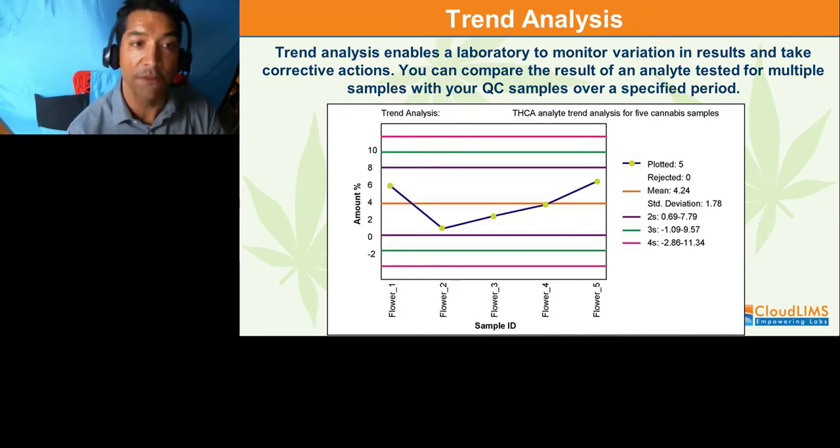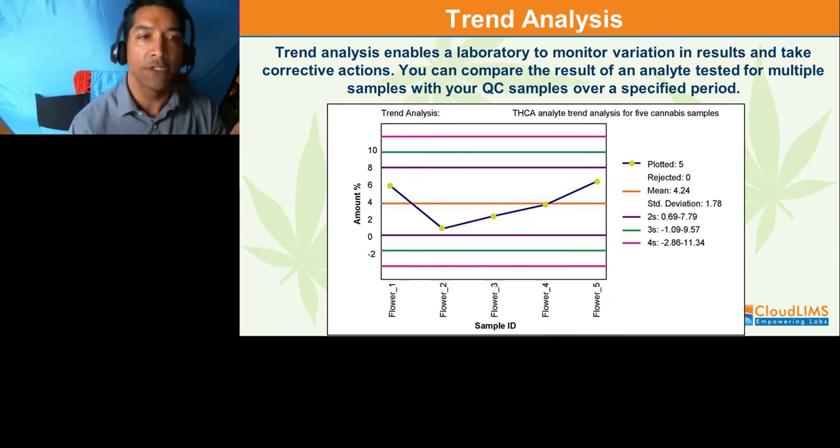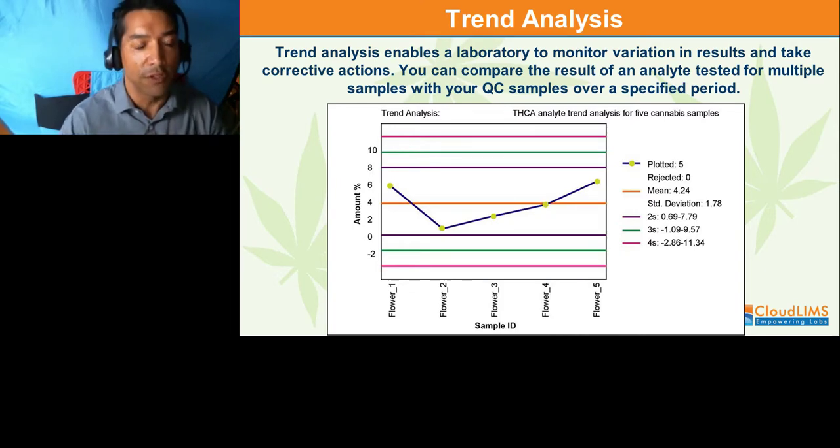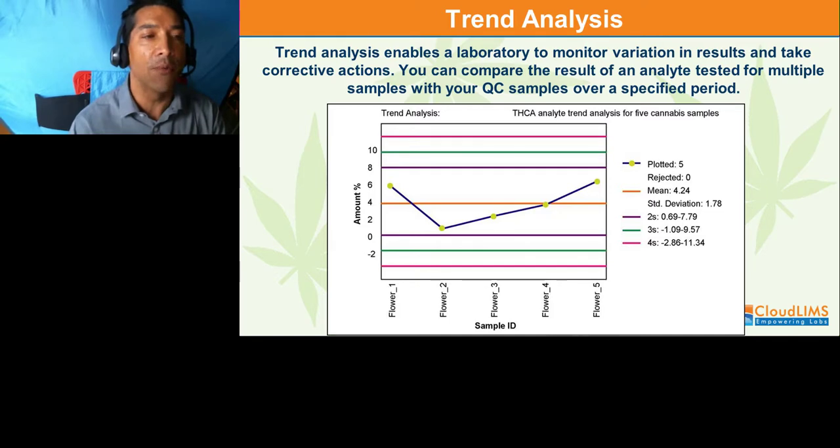You can optimize for your yield, so that, let's say you're running an extraction. You can run an extraction forever, and you'll keep getting more and more of the product out. But it's a diminishing return. So at some point, it is of greater benefit for you to stop the process, to throw away that starting material and put in a new batch and start your second batch. You'll only know what that time is by doing trend analysis. With trend analysis, you get to optimize the timing for your entire extraction process.